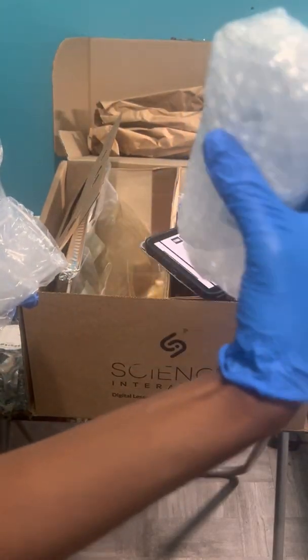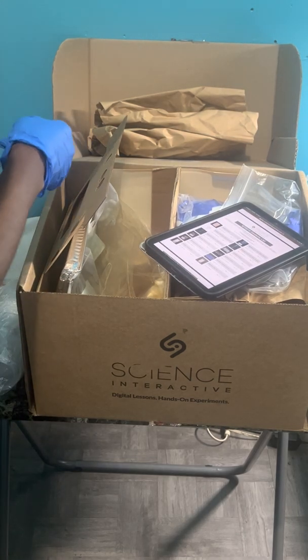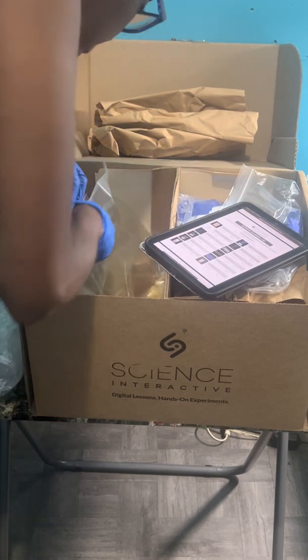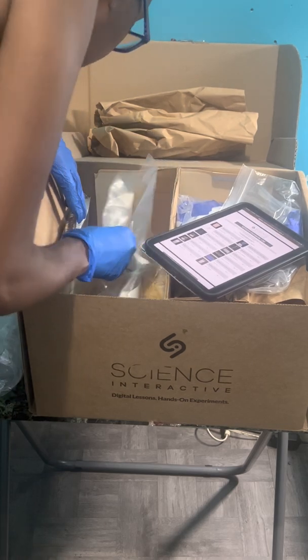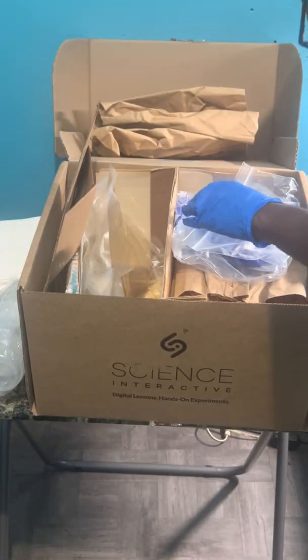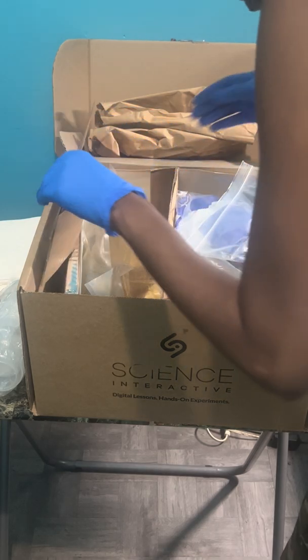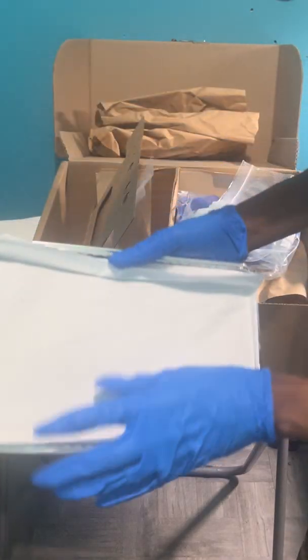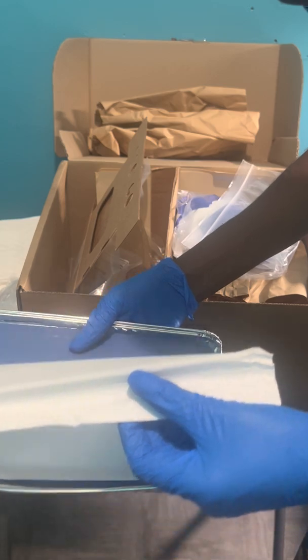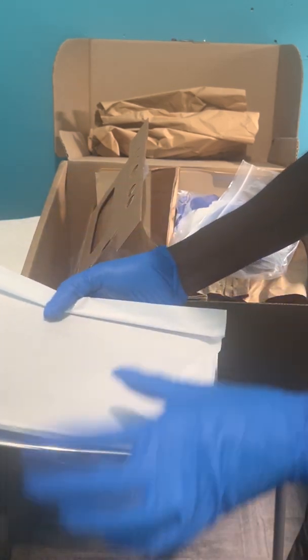We have some glass beakers, little test tubes, pipettes — there's a bag of pipettes. On the side over here, we have the dissection tray — the pad — you open it up and it has a pad so you can pin down the specimen.